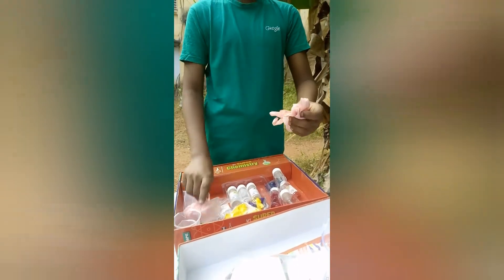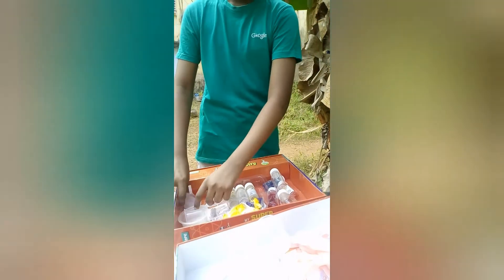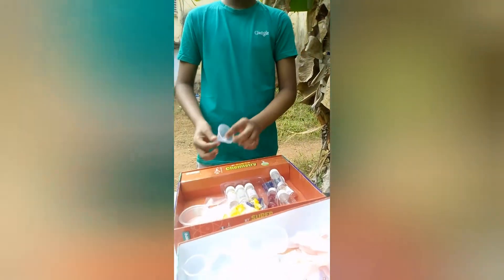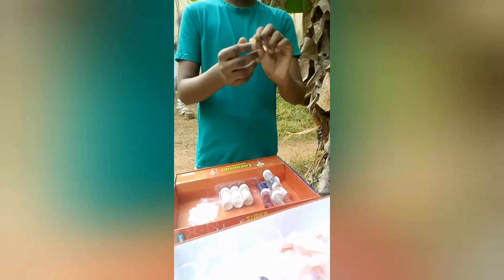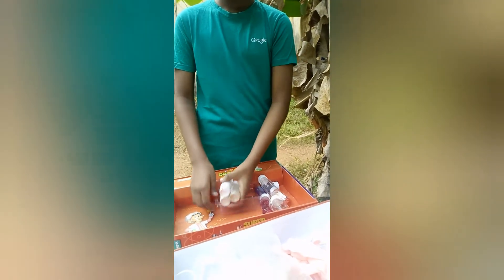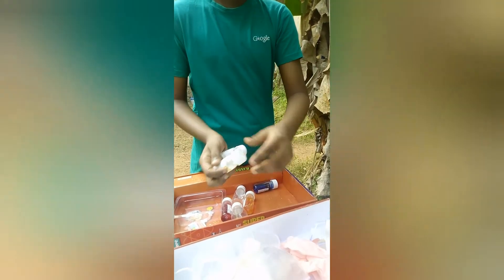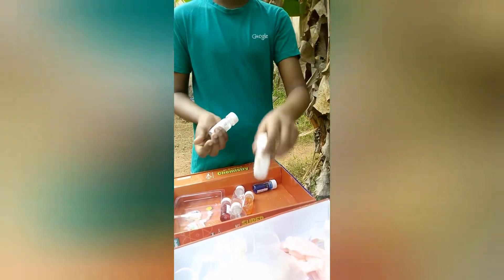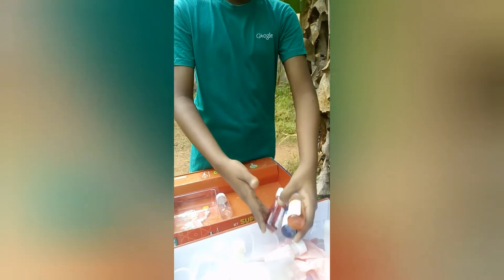One pair of goggles, one pair of gloves, then two large beakers and two small beakers, a component bowl, a set of balloons and a string, a pH measuring strip, then four plastic bags. And three different chemicals: sodium alginate — 8 grams — then guar gum, then calcium chloride, and three different food colors.